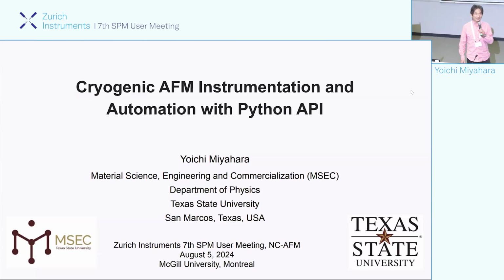It's my great pleasure to be here to talk about my experience in setting up a new lab. I actually moved to Texas State University 5 years ago from McGill, Peter Gupta's lab. And I've been spending lots of time setting up my lab. So I'm going to talk about cryogenic AFM instrumentation and automation with Python API using MFLI lock-in.